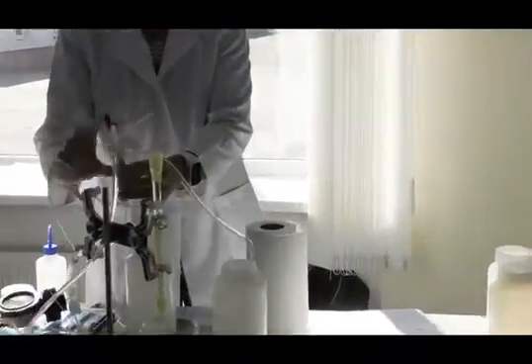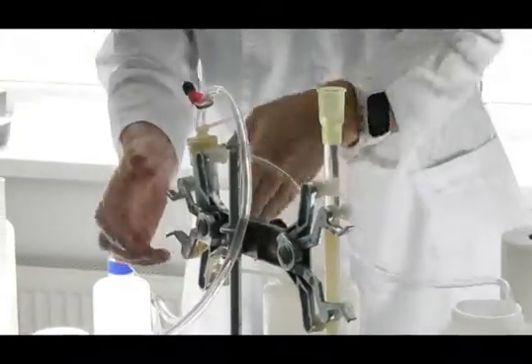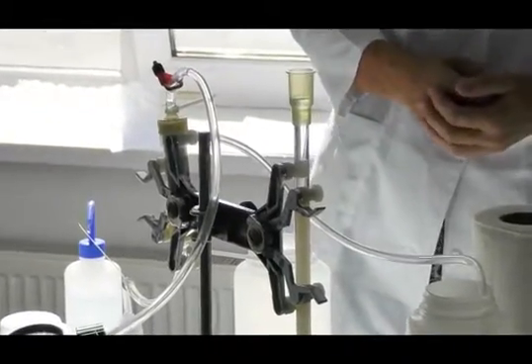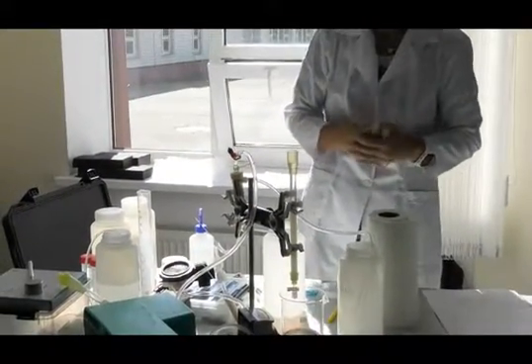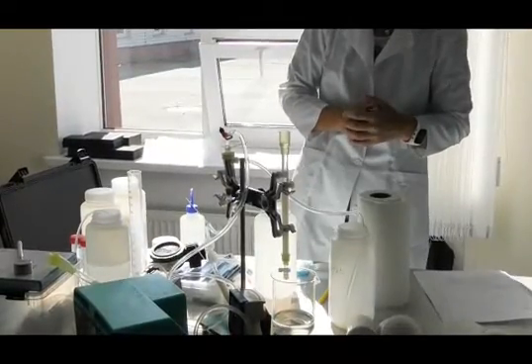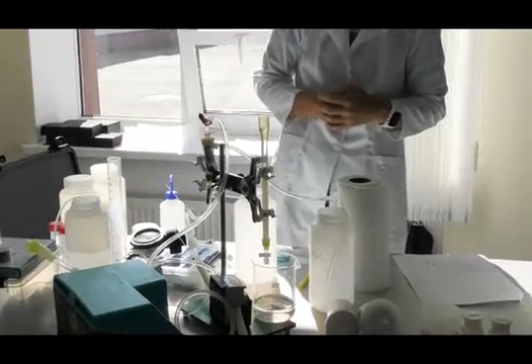And this is a very small one that you normally just use in the lab because it can't take that much sample at a time. But we normally use a much bigger one out in the field, that can maybe give half a liter per minute or something in sampling. This just gives too little in the field.